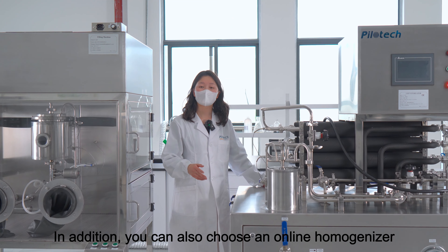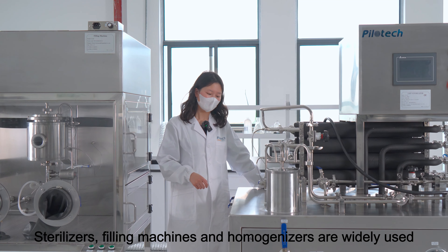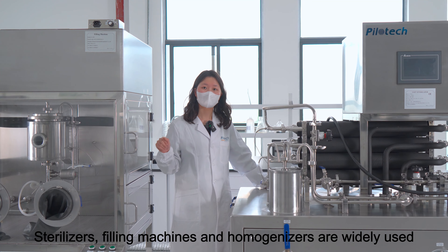In addition, you can also choose an online homogenizer. Sterilizers, filling machines, and homogenizers are widely used together.